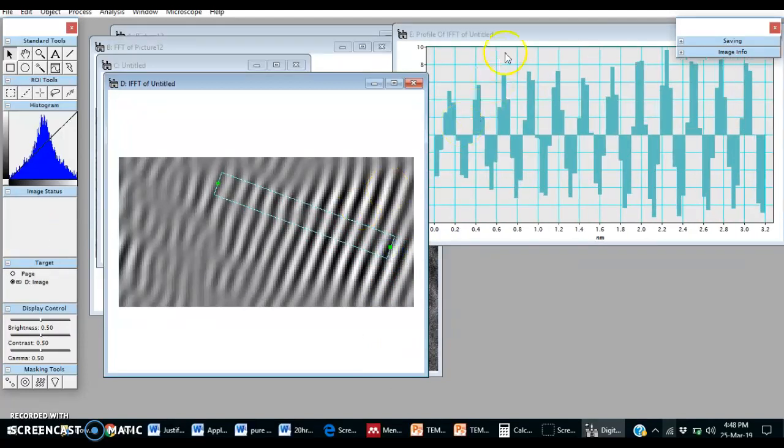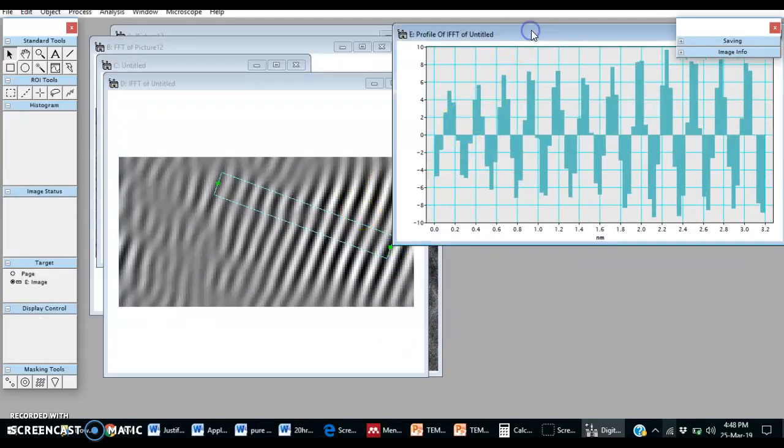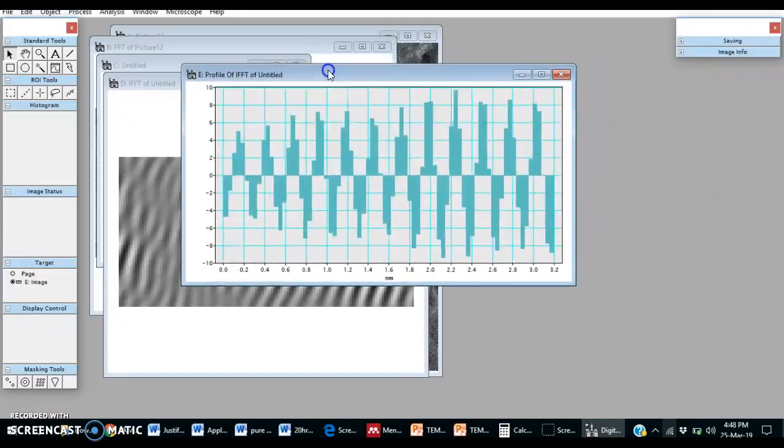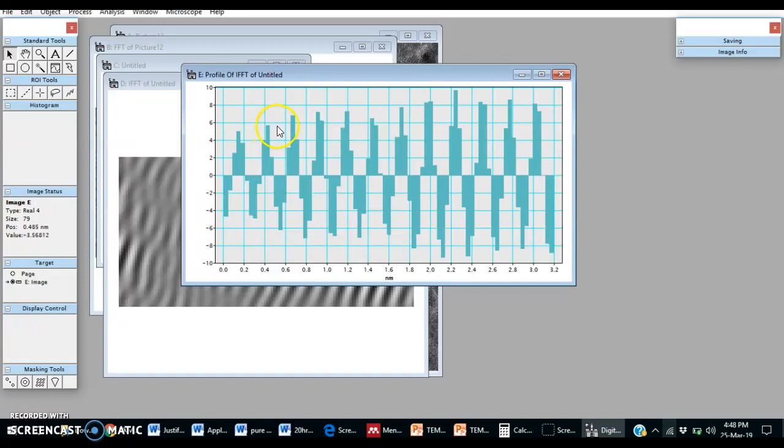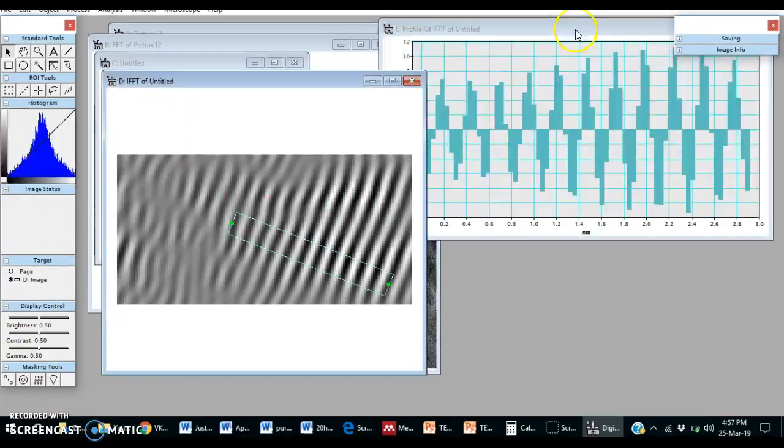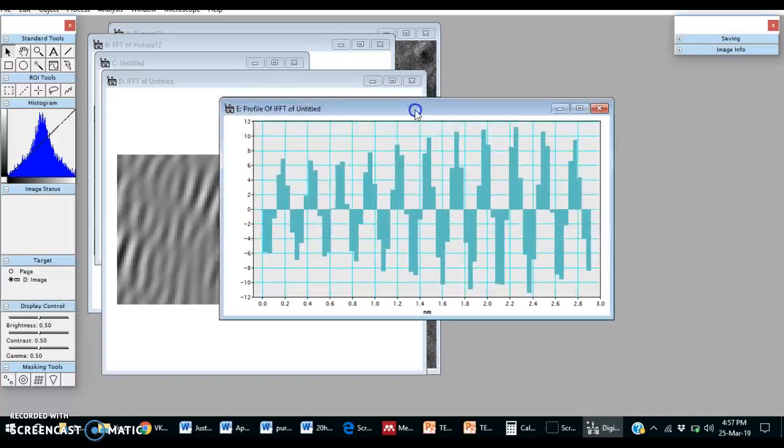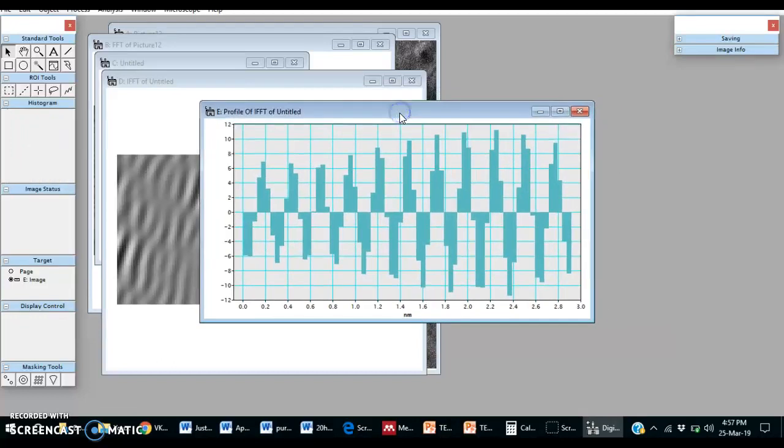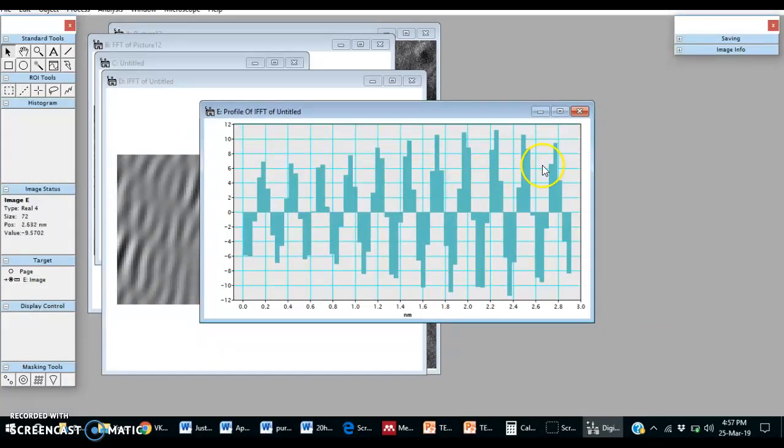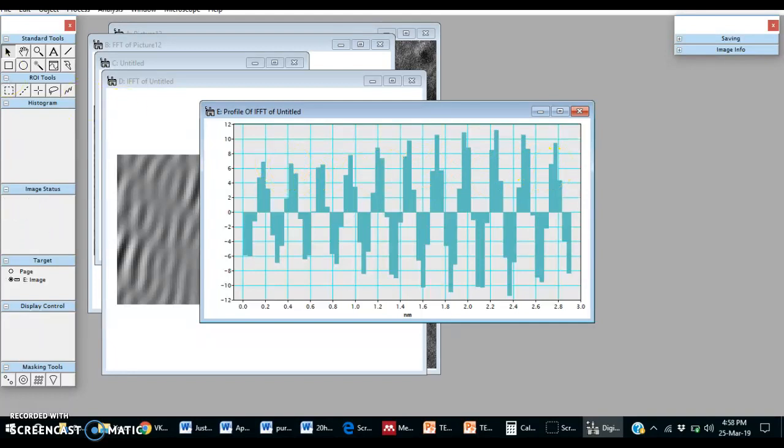Let's work on this image now. Select any two similar height. These two points are at similar height, so just select.